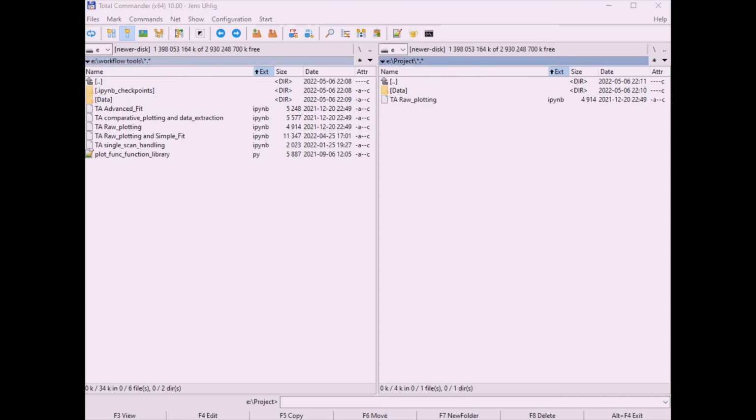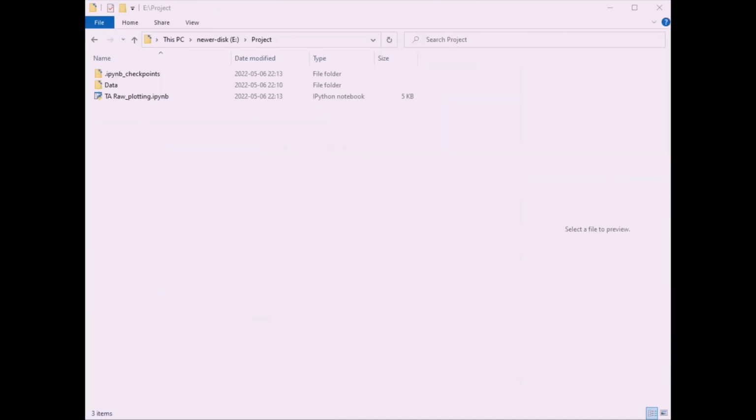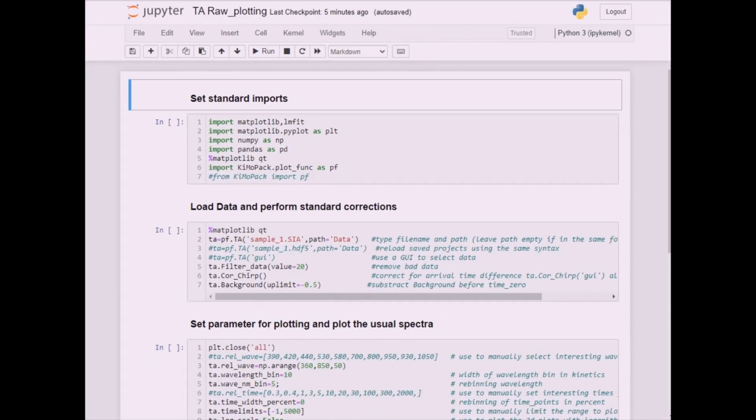If you have also installed nbopen, then you can simply double click on the notebooks to open them for analysis. Alternatively, typing in any command line in this folder jupyter notebook will open a new server in this folder. Use the tab button and navigate to your analysis folder. It allows you further analysis.